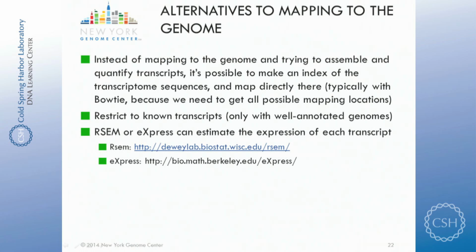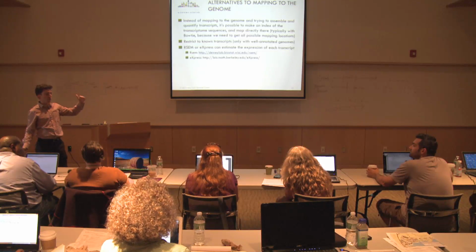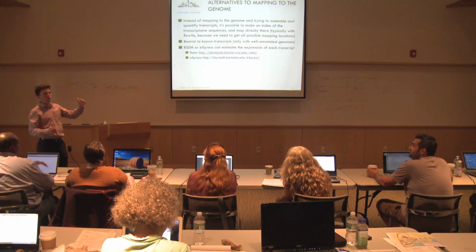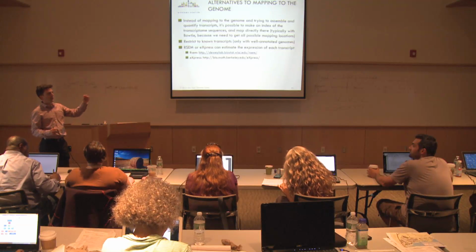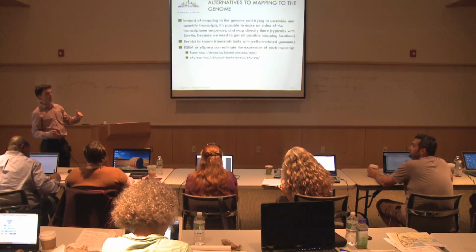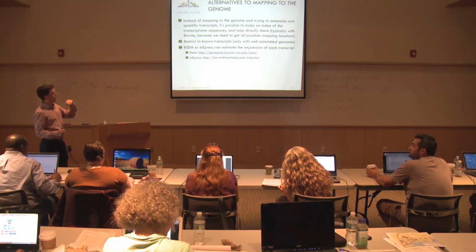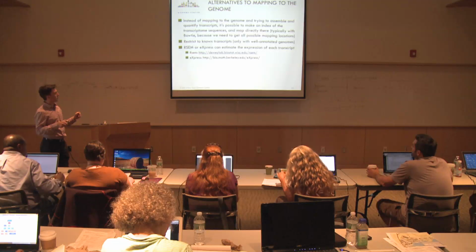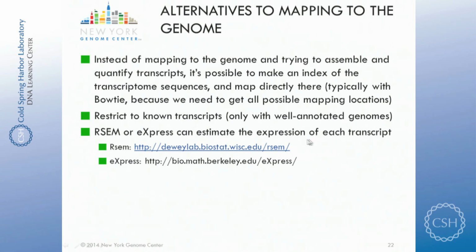So that makes a very big alignment file, because the header, instead of having all the chromosomes, will suddenly have all the transcripts with their size, and then for each read, all the different locations it can have. It can map to 15 different isoforms, if there are 15 isoforms. But then out of that, you can use one of those 2 tools that are quite equivalent, and that will estimate the expression of each transcript. So I can also describe that briefly.